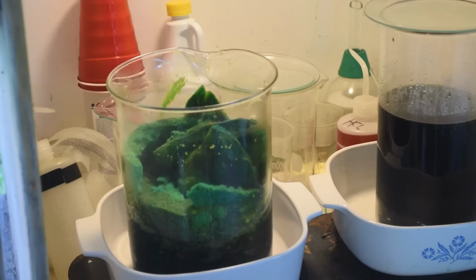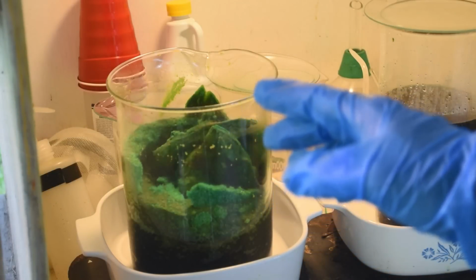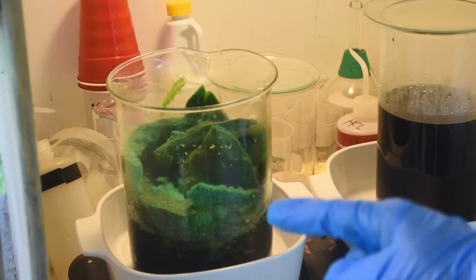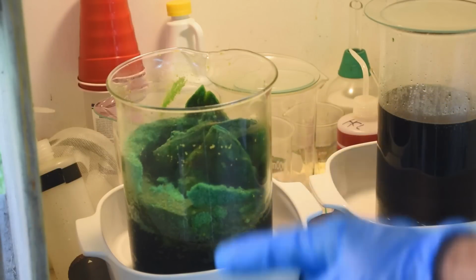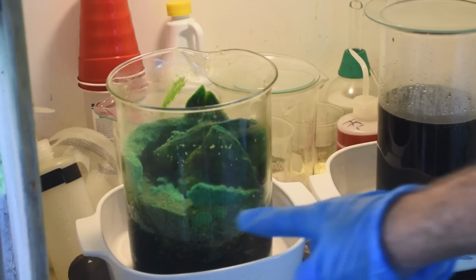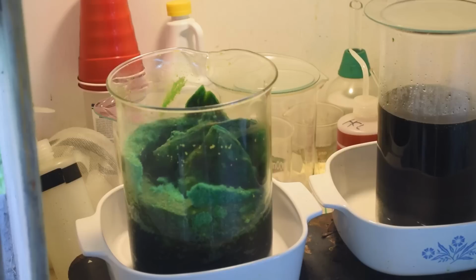I'm thinking if I add water to this, all of the salts in here except palladium chloride should dissolve. Palladium chloride should be left behind as a solid. So that's a possibility. And I see that there's still a whole lot of this type liquid in there, but it's just sort of absorbed into this green goo.